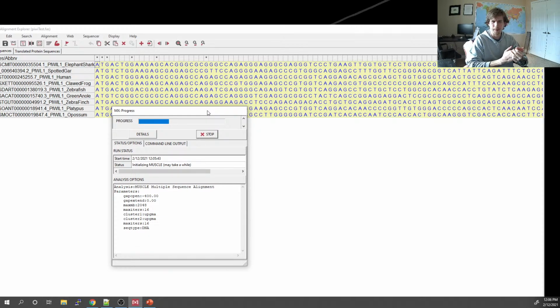The more sequences we add, the more the process will always slow down. Like the analytics, the process itself will always slow down the more data that we have. So I picked 10 sequences to play around with, so the amount of time we wait on programs to finish reduces. But even this, man, this is kind of slow. Let's see the consequences of this.